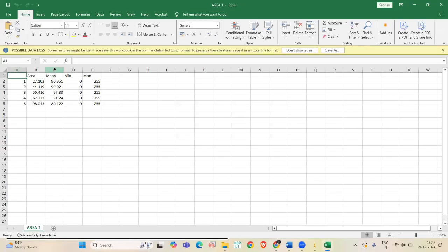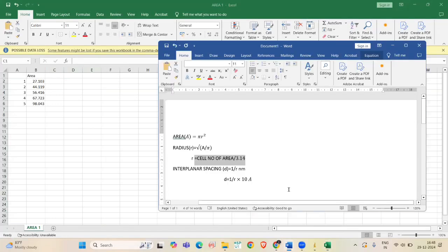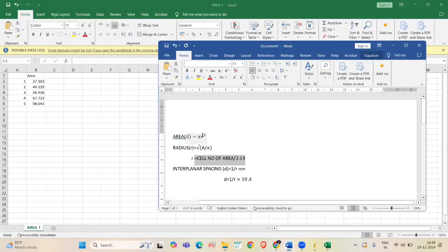We don't want these three columns, so I am just deleting that. From this area, we have to find radius and interplanar spacing value. For that, we use the area formula.